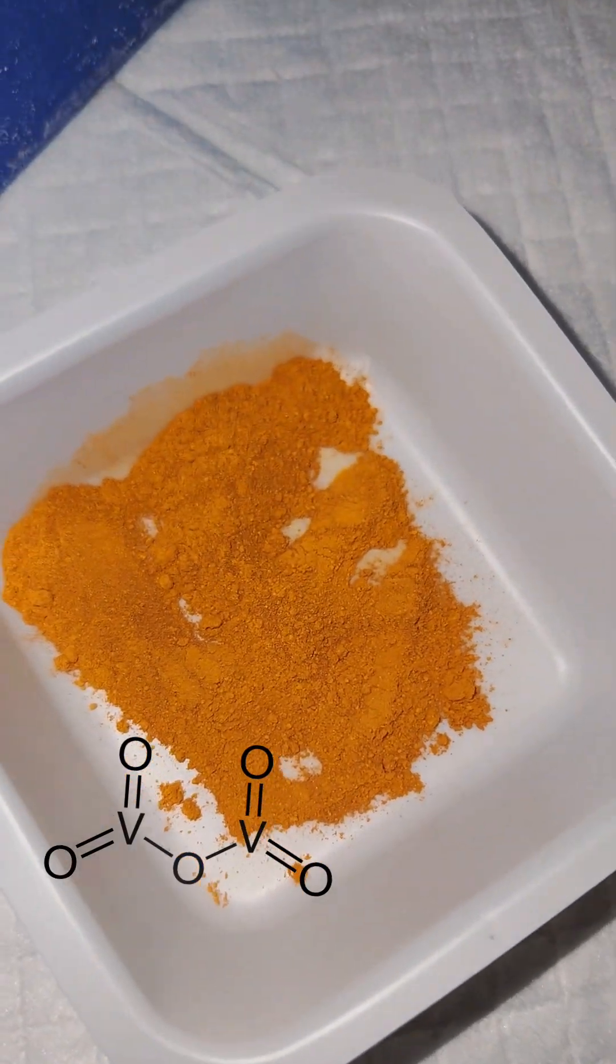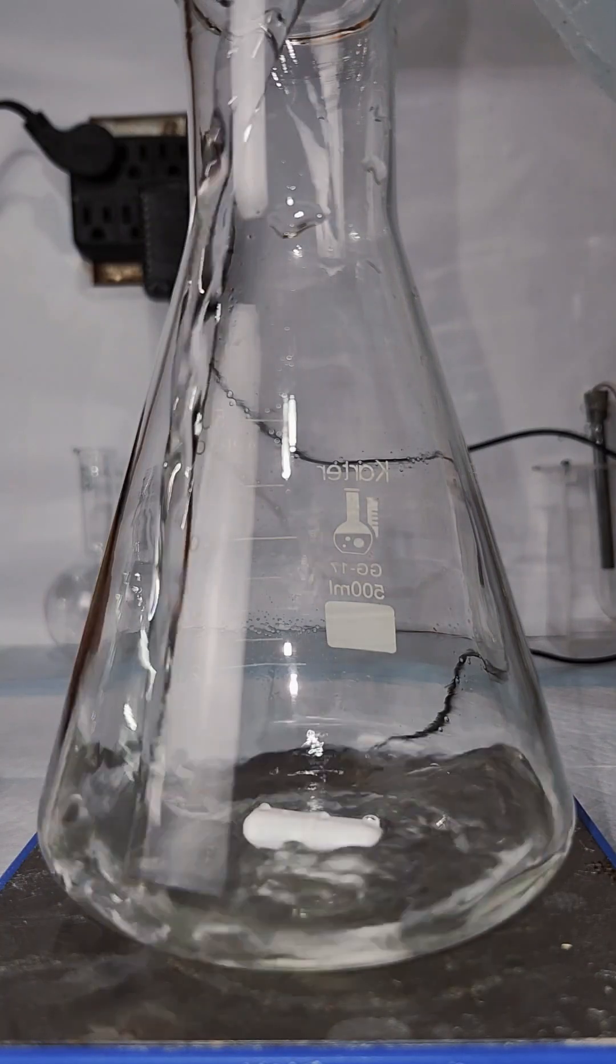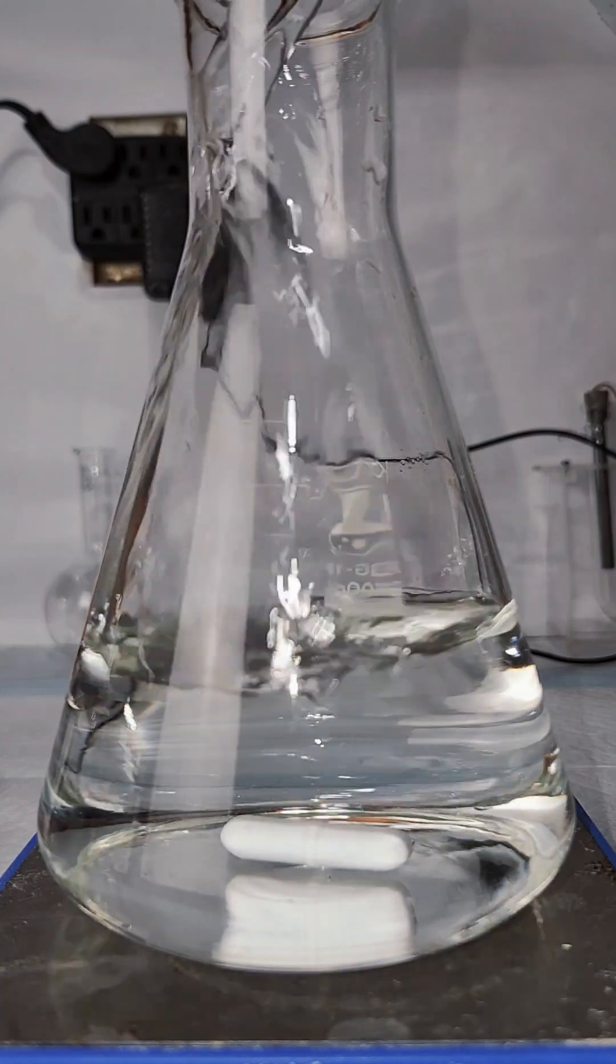To do this demo, I start with the yellow powder vanadium pentoxide, which puts vanadium in its plus five oxidation state.